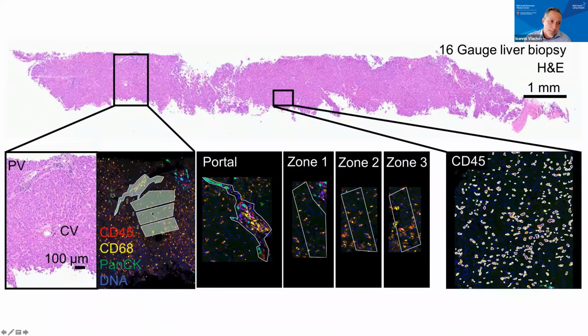So this gradient dictates partially a liver cell function, and also enables us to split the lobular area into 3 zones: zone 1, zone 2, and zone 3 of the liver lobule. So liver is an organ where spatial structure and architecture really play a very big role on function. So that was very key to guide our region of interest selection. And also we used CD45, so we got region CD45 plus from the same ROI, and then CD45 minus.